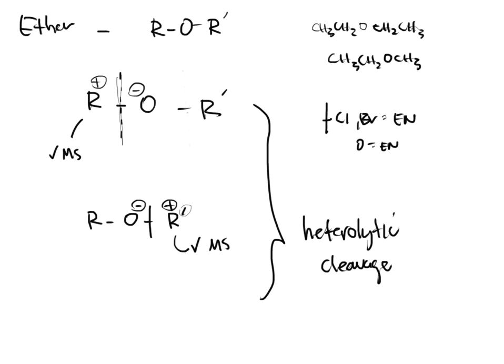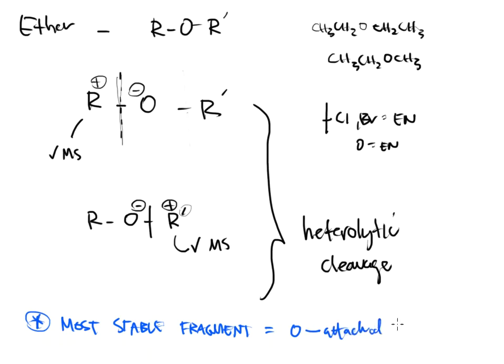There's also a statement that I want you to burn in your brain down here at the very bottom. The most stable fragment is the one where oxygen gets attached to the bigger piece in a heterolytic cleavage.